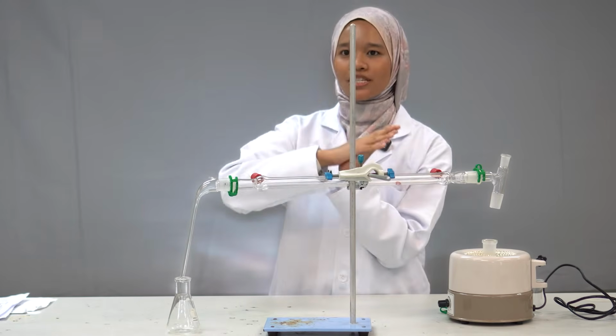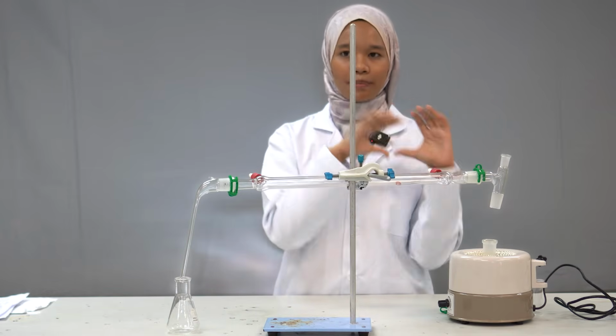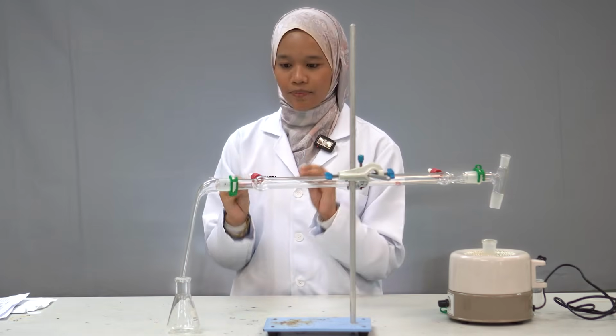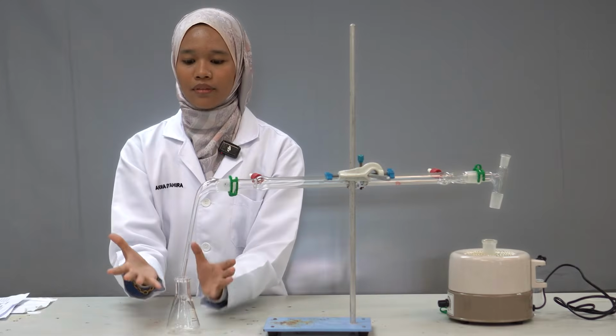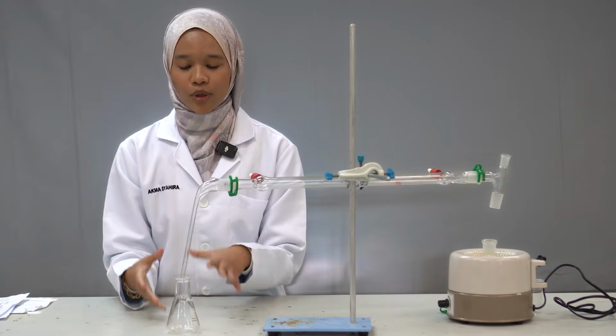When the hot vapor contacts the cool surface, it transforms into the liquid phase. That's why in the receiving flask, we will get the product, which is the pure DCM.